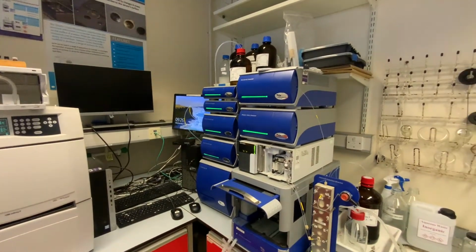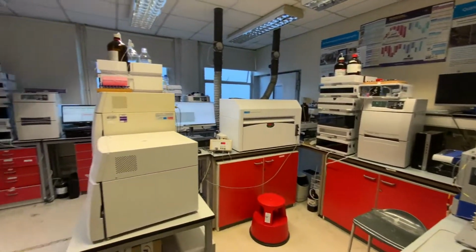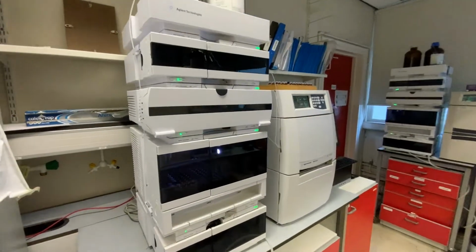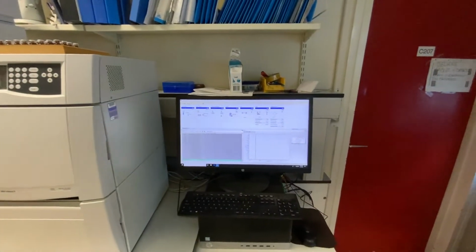Solubility is key, and for this reason we have a number of instruments full-time in DMF, water, chloroform and THF, and even TCB for high-temperature applications such as polyethylene or polypropylene. This lab also contains an AF4, asymmetric field flow fractionation instrument, capable of separating and sizing nanomaterials.